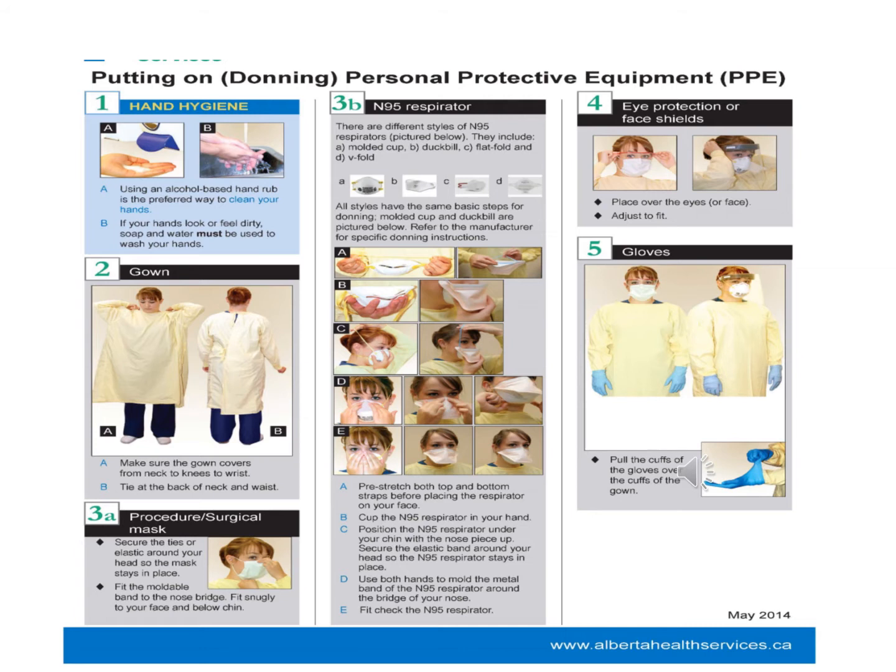Gloves will be the last step. While you are dealing with dangerous chemicals, stretch the gloves so that they reach over the cuff of your gown, so that there is no area that can be exposed to the chemicals. Just cover the whole skin.